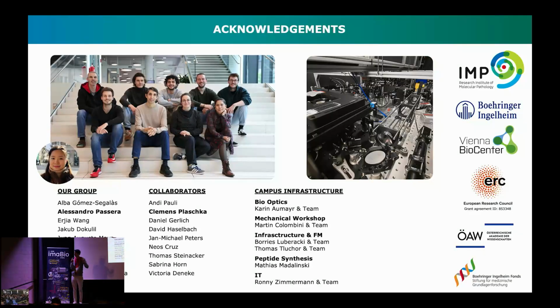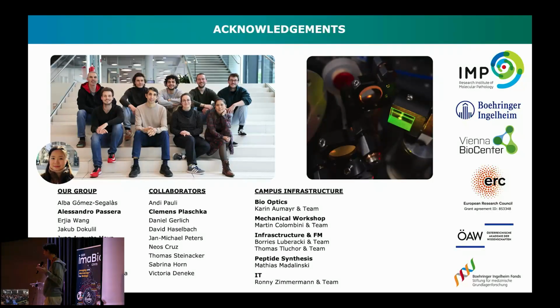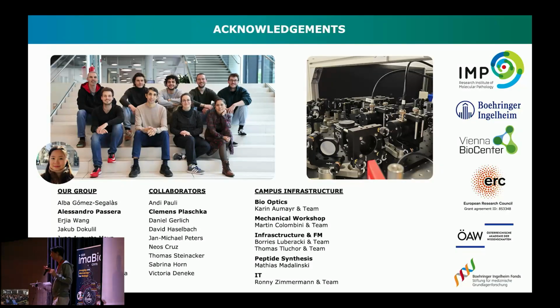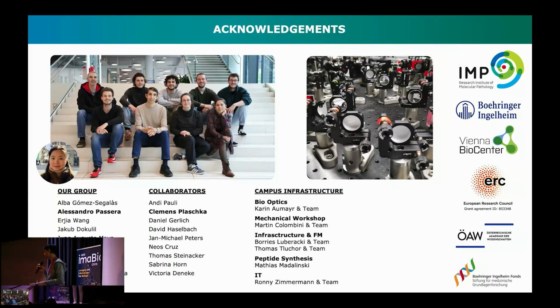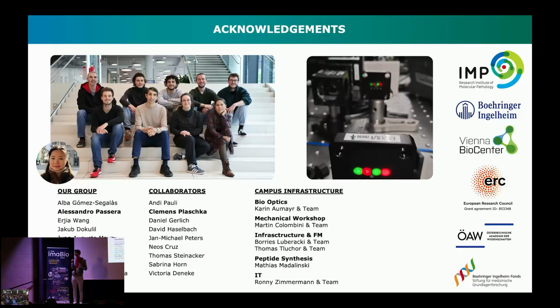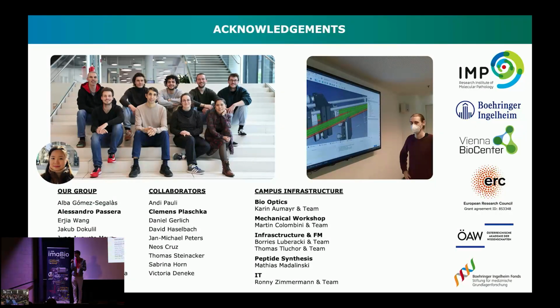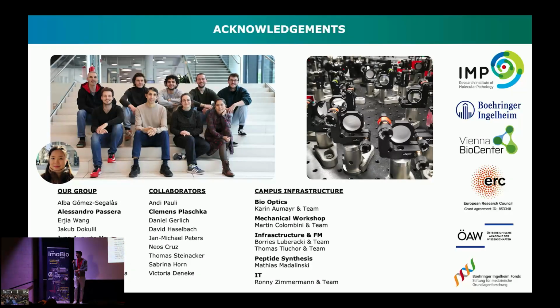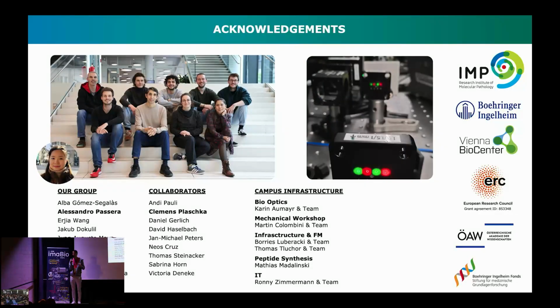For the acquisition, wide field data is just 20 minutes per round. So if you do 3 rounds in an hour, you get a cell. I think it's okay. It's at the RESI level, or this type of thing. Then if you do MINFLUX on it, you do need to stay. So you get, say, 3 particles per hour, something like this. Very slow. That's why for DNA-PAINT MINFLUX we have few things, and for wide field DNA-PAINT, we have hundreds of particles. Not 1,000, not 10,000.